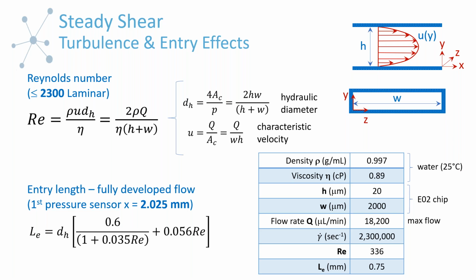And so the only thing we need to know to calculate this Reynolds number are our volumetric flow rate, the density of the fluid we're looking at, the estimate of the viscosity that we have, so we could use the Newtonian low shear plateau, for example, or anywhere along the shear rate curve, and then also the dimensions of the flow channel. And what we can see is an example of how this parameter plays out and whether or not we would expect turbulence in our flow channel.